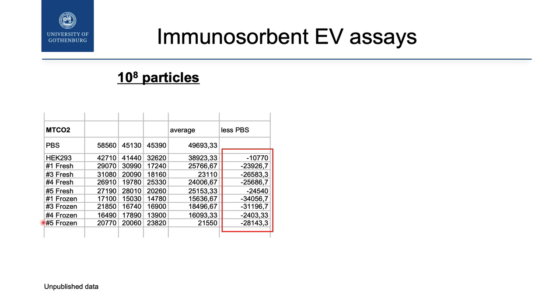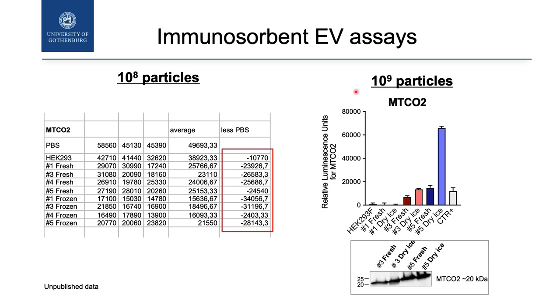I was looking at the marker MTCO2. When I subtracted what I collected from the blank — in this case PBS — I got negative numbers, meaning I don't have vesicles that are positive for this marker. But when I repeated it just increasing the amount of vesicles — loading 10 to the 8 particles I got nothing, but loading 10 to the 9 particles — some samples were negative as expected, but the others had this marker on the surface. I confirmed this by western blot as well.